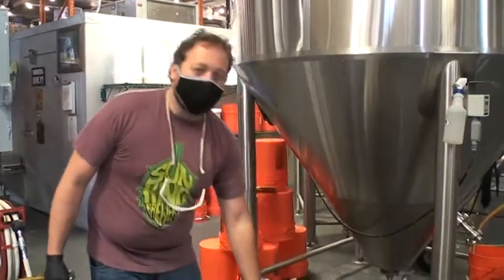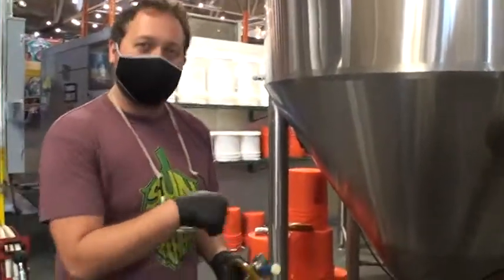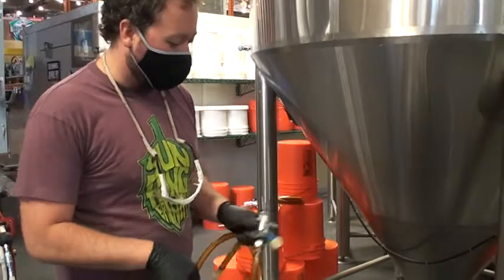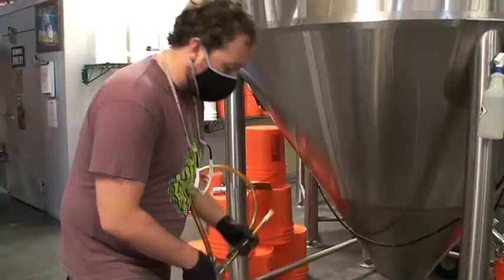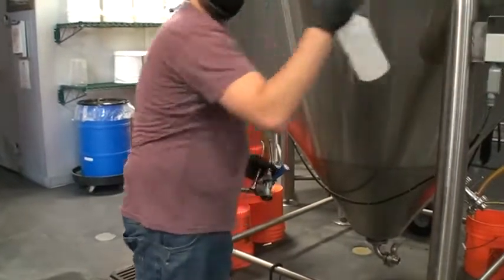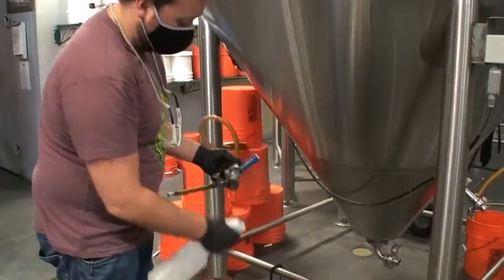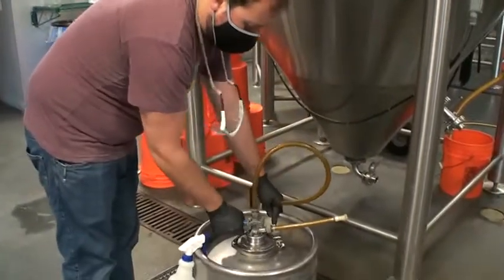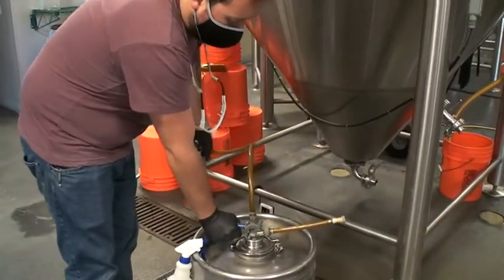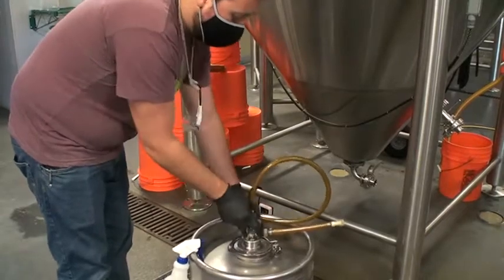So, our first step is to degas. It's pressurized, so we don't want to open it up right away. Just a coupler, open end to it. Always just spray down. Already degassed. That's not good.